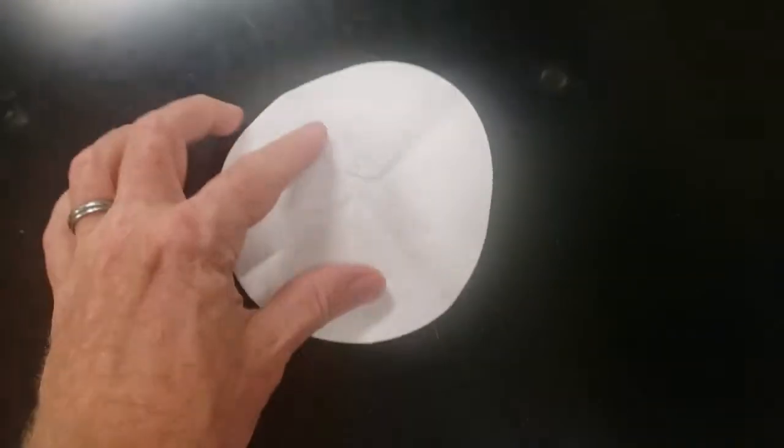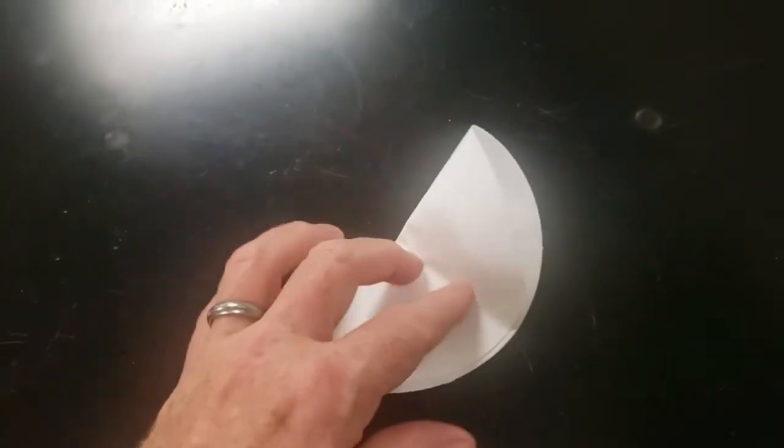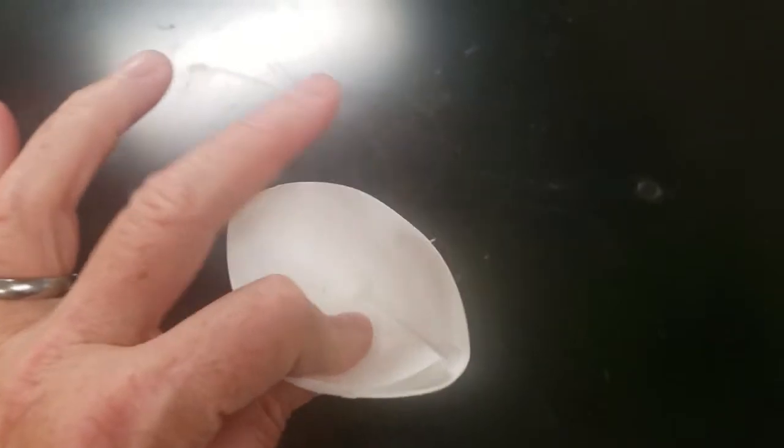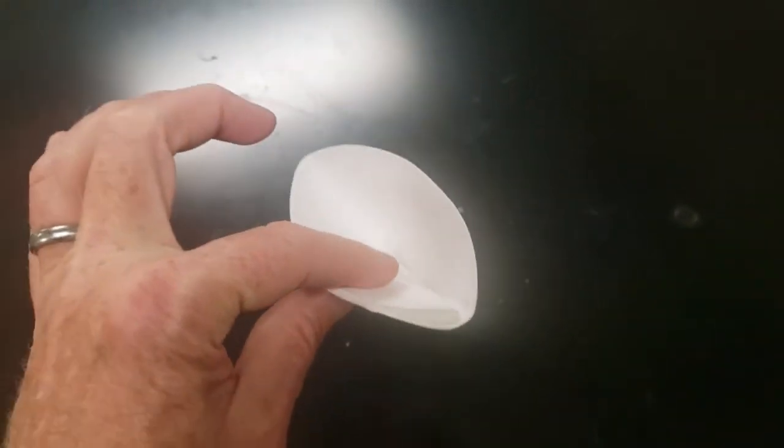That'll slip out. And finally, this is filter paper. It's a round piece of paper. It's good for filtering just like you would coffee. It filters out solids, and it's for gravity filtration.